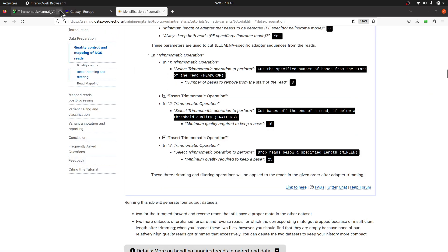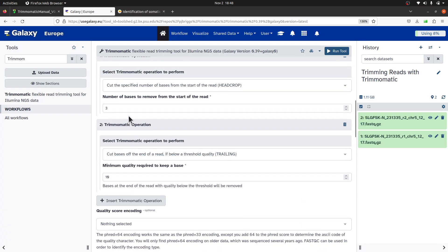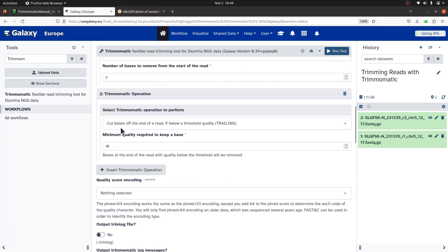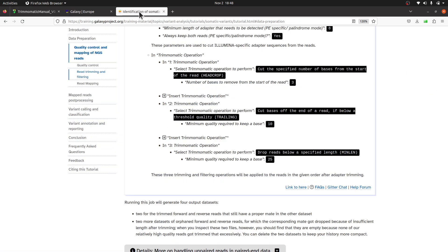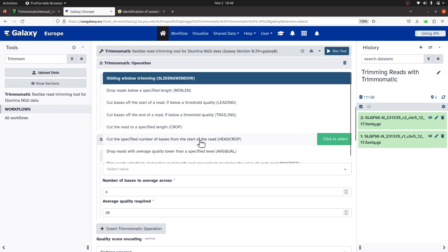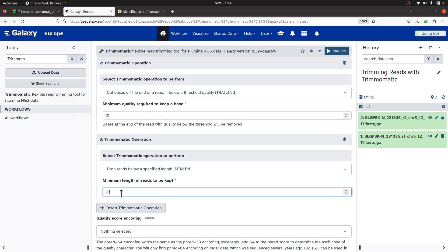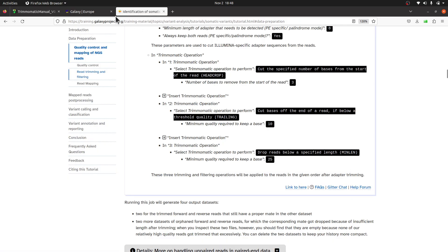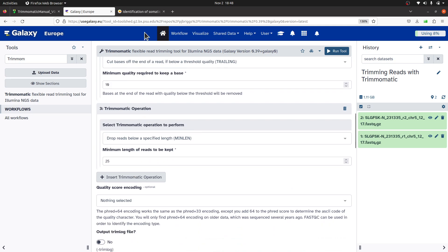So now we have two operations. Let's add a third one. Click 'Insert Trimmomatic operation' and select MINLEN — drop reads below a specific length. Set the minimum length value to 25. Confirm the value is 25. We now have three Trimmomatic operations configured.